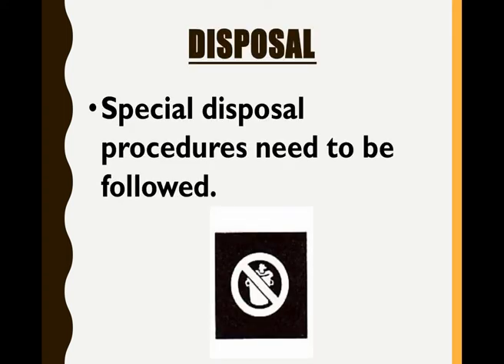Take a moment, look at this symbol. What do you think this symbol means? This symbol is about how you dispose of certain materials. So when we talk about doing a lab or something like that, if you see this symbol, it means that there are certain procedures that need to be followed when you go to throw something out.